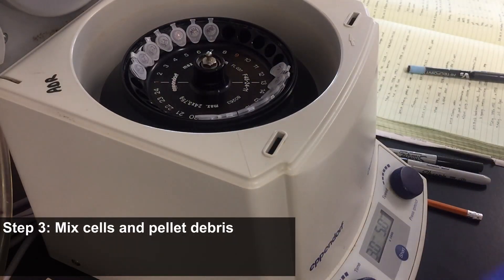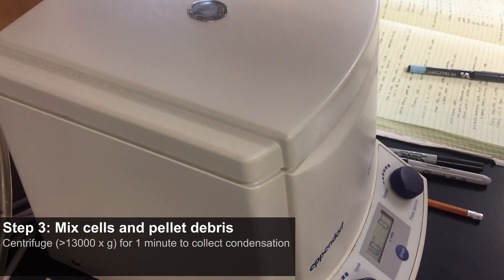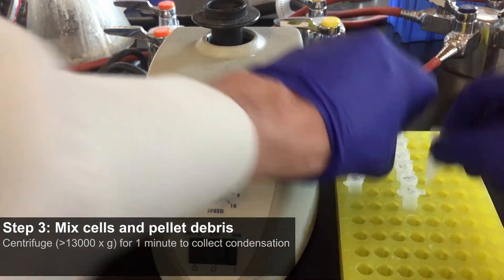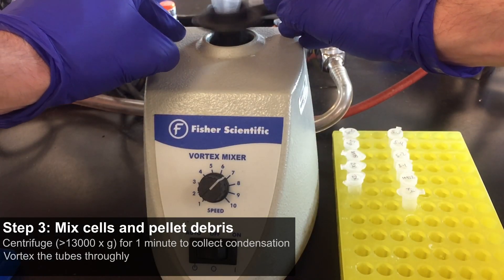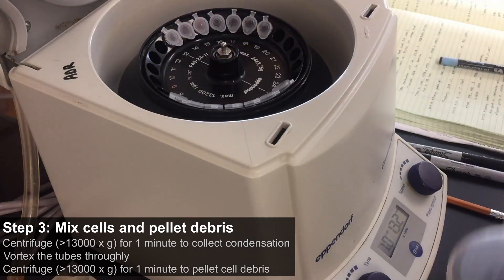Step 3: Mix cells and pellet debris. Centrifuge at 13,000 times gravity for 1 minute to collect condensation. Vortex the tubes thoroughly. Centrifuge at 13,000 times gravity for 1 minute to pellet cell debris.